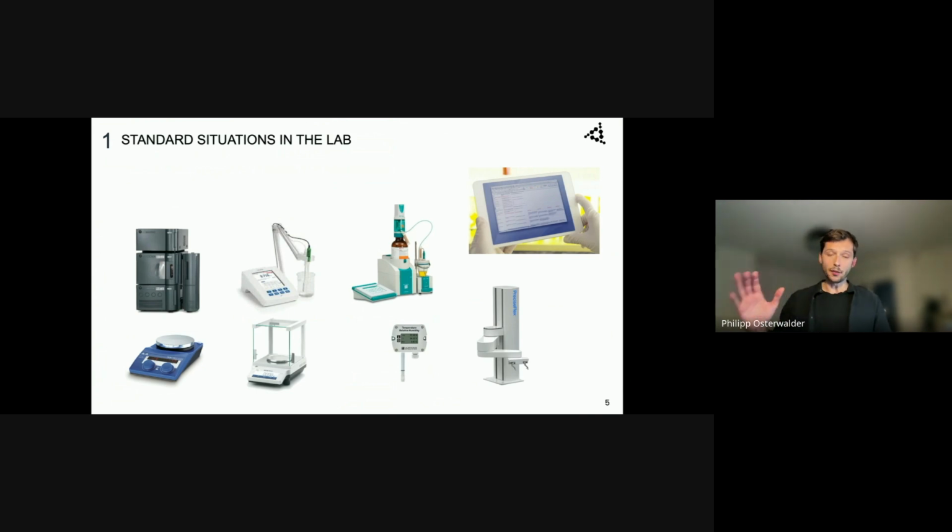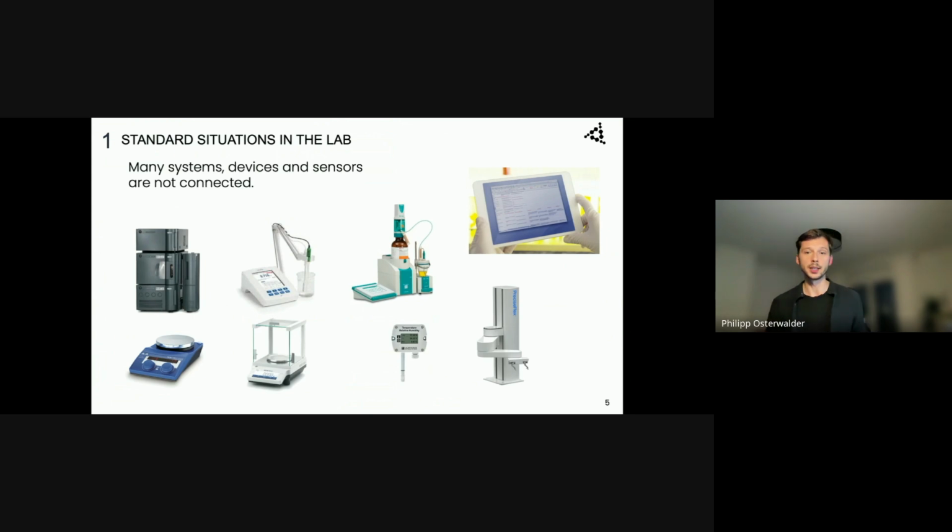There is a fourth point, which is not so common in the food industry, but in some other segments of material science and life sciences, biotechnology, pharma, or the chemical raw material manufacturing industry, there is a heterogeneous zoo of different devices, and they hold siloed data, which, from my point of view as a lab technician, every quality data and laboratory data is pure gold.